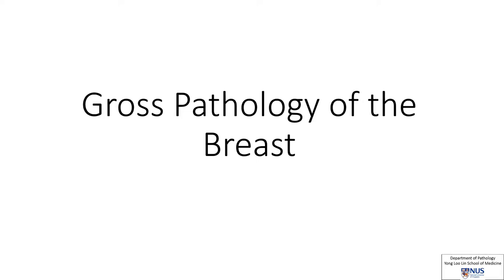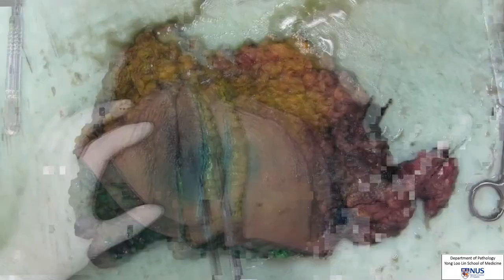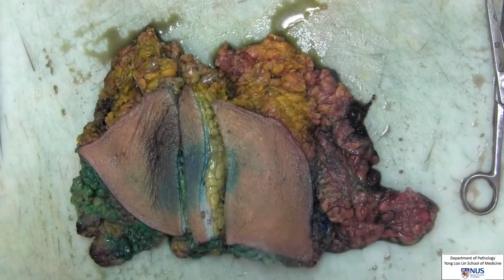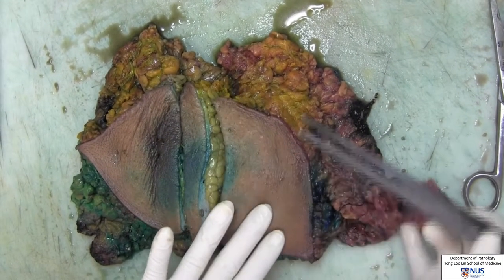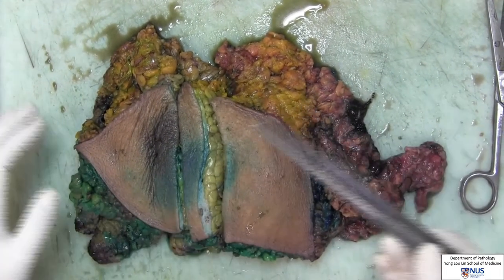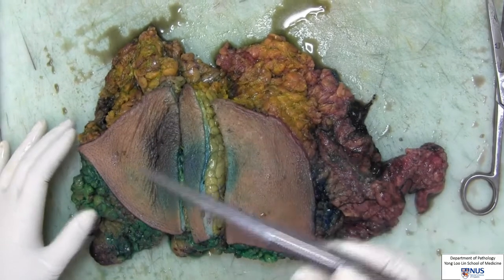Today in the pathology lab, we will be examining the gross pathology of a breast specimen. We will start off with the description with measurements of the breast specimen, followed by sampling.